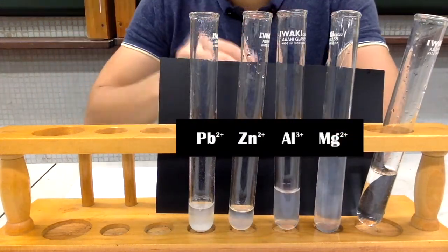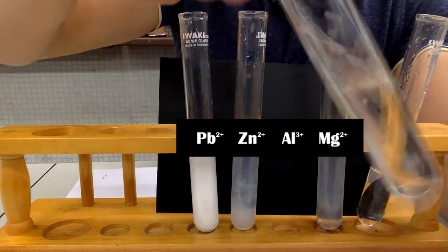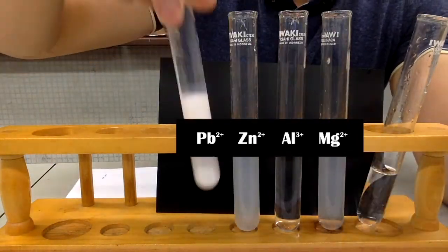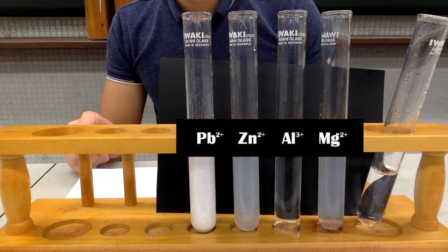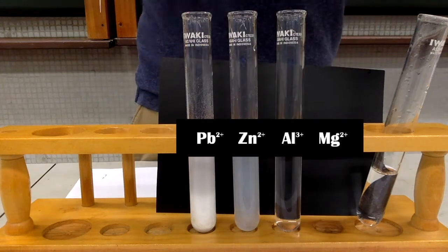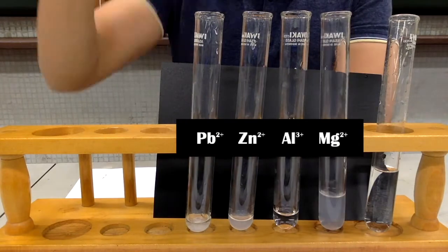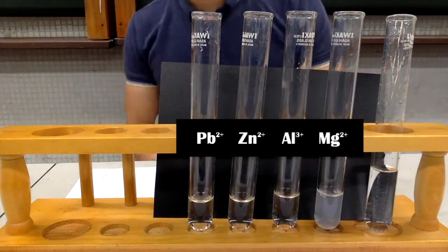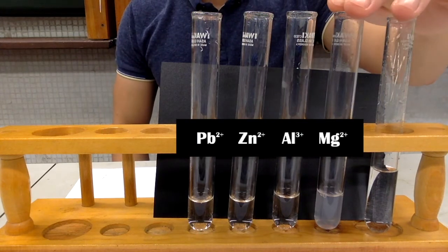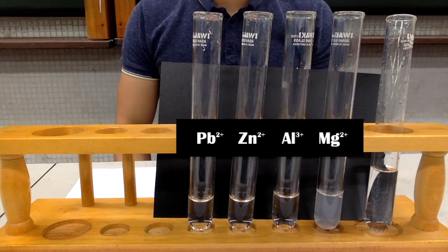Add excess amount of dilute sodium hydroxide solution in all 4 samples and see whether the white precipitate will dissolve. It is observed that the white precipitate with aluminum ions has dissolved. To further investigate, transfer a small proportion of the reaction mixture into new test tubes and add dilute sodium hydroxide solution. It is now observed that the white precipitate in both lead ion and zinc ion has dissolved in excess dilute sodium hydroxide solution. On the other hand, the white precipitate with magnesium ion remains undissolved.